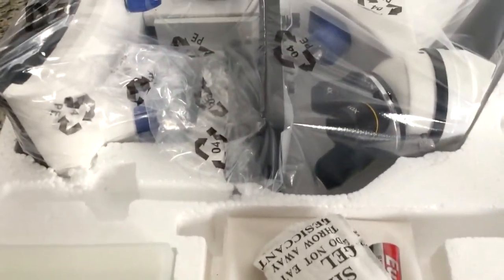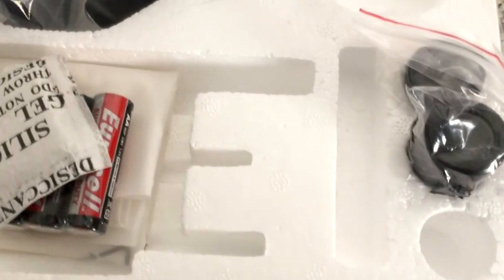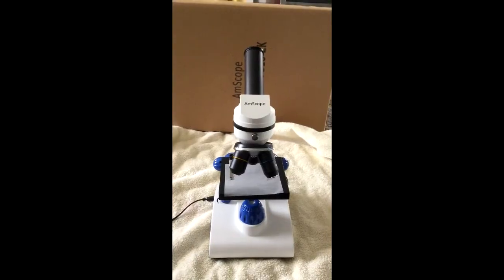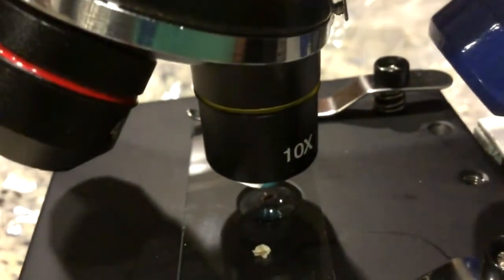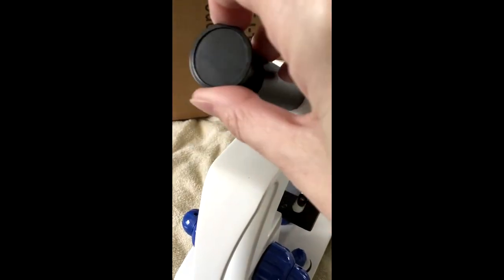This is the microscope once the styrofoam container is opened. These are the eyepiece lenses. There's a cover for the microscope folded up here. Here's the microscope out of the box. Here's the on-off switch for the light. These are the objective lenses with the magnification of 4x, 10x, and 40x. Here are the 10x and 25x eyepiece lenses. You just slip in an eyepiece like this.